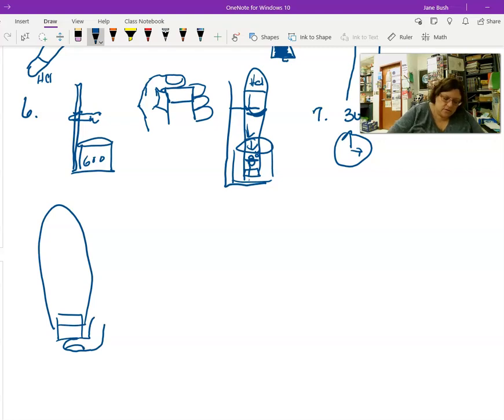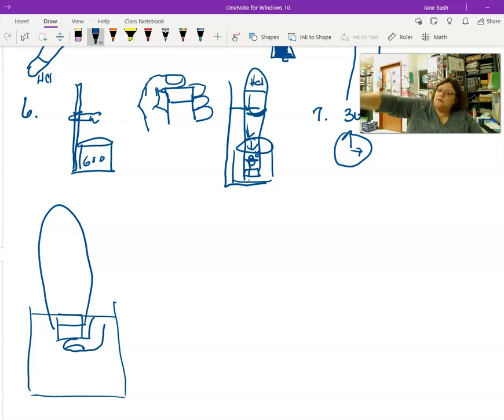And you're going to reach inside of that 600 milliliter beaker, and I'll demonstrate this in class. Put your thumb over the end. You're going to pick it out, and you're going to put it into a long graduated cylinder. So this is still step 7.